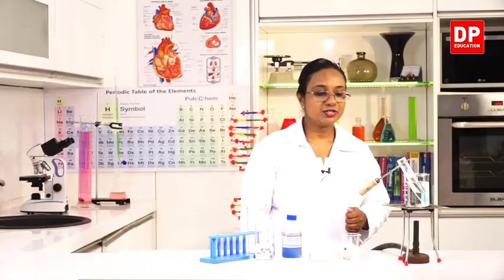Even if we keep on heating this for a long time, there will be no color change because sucrose is a disaccharide. Then to obtain the color change, we will have to do the second part of the activity.